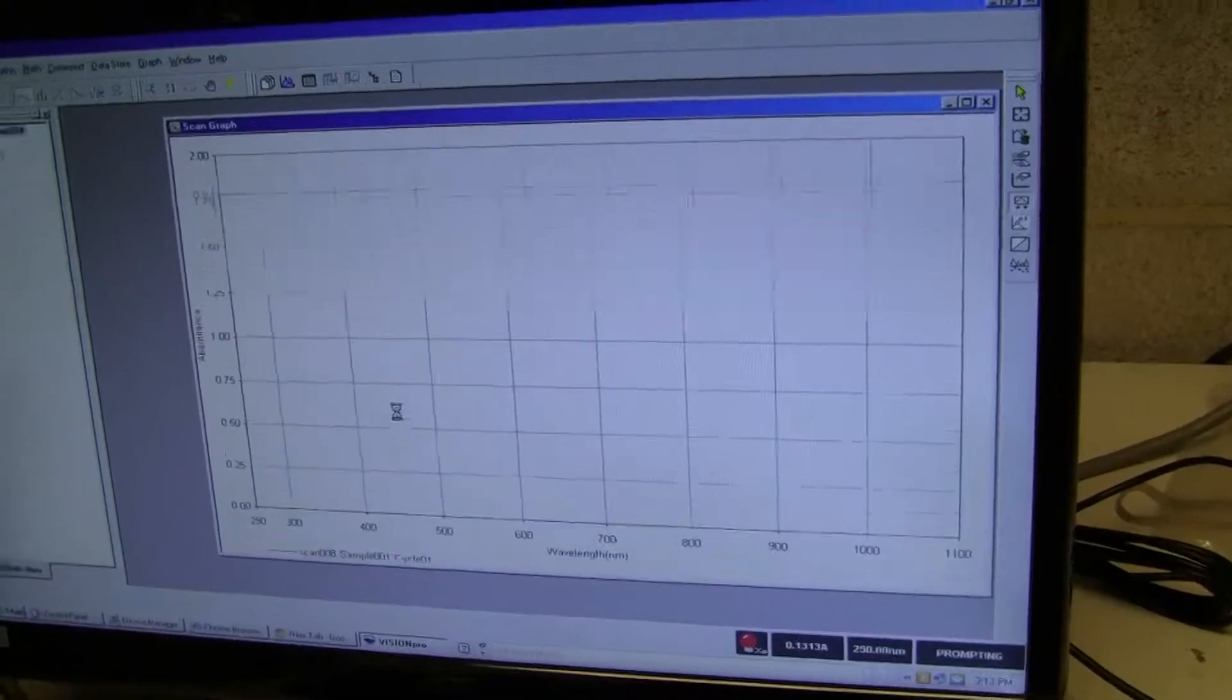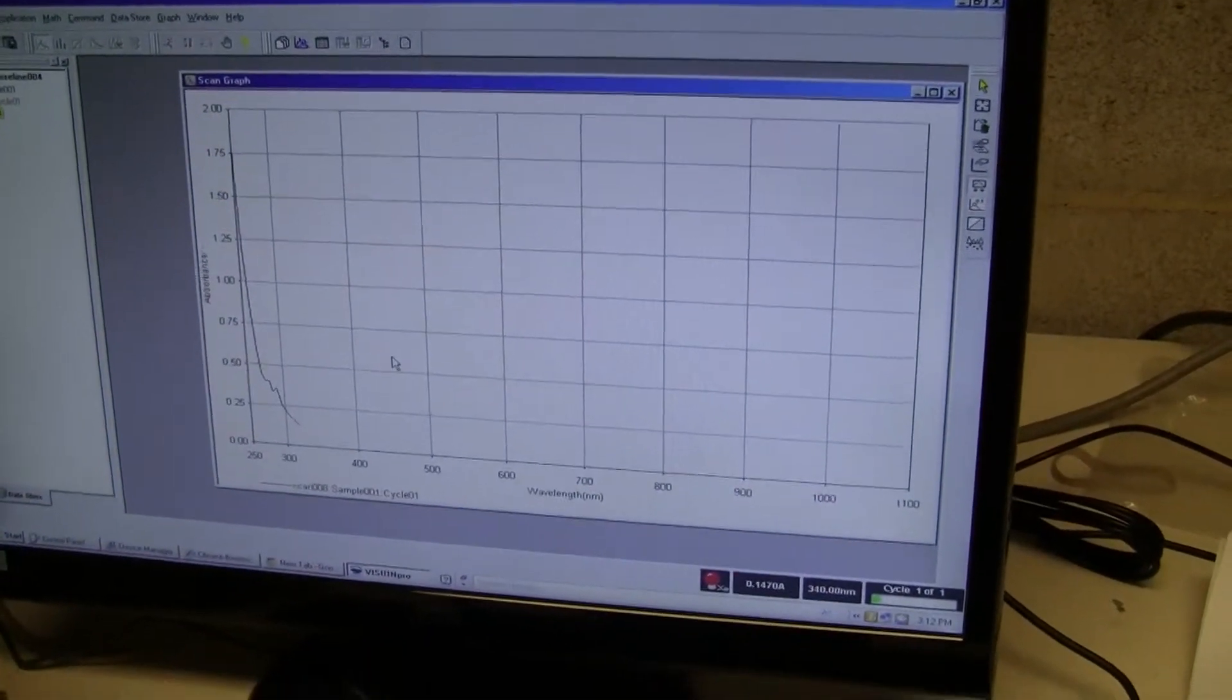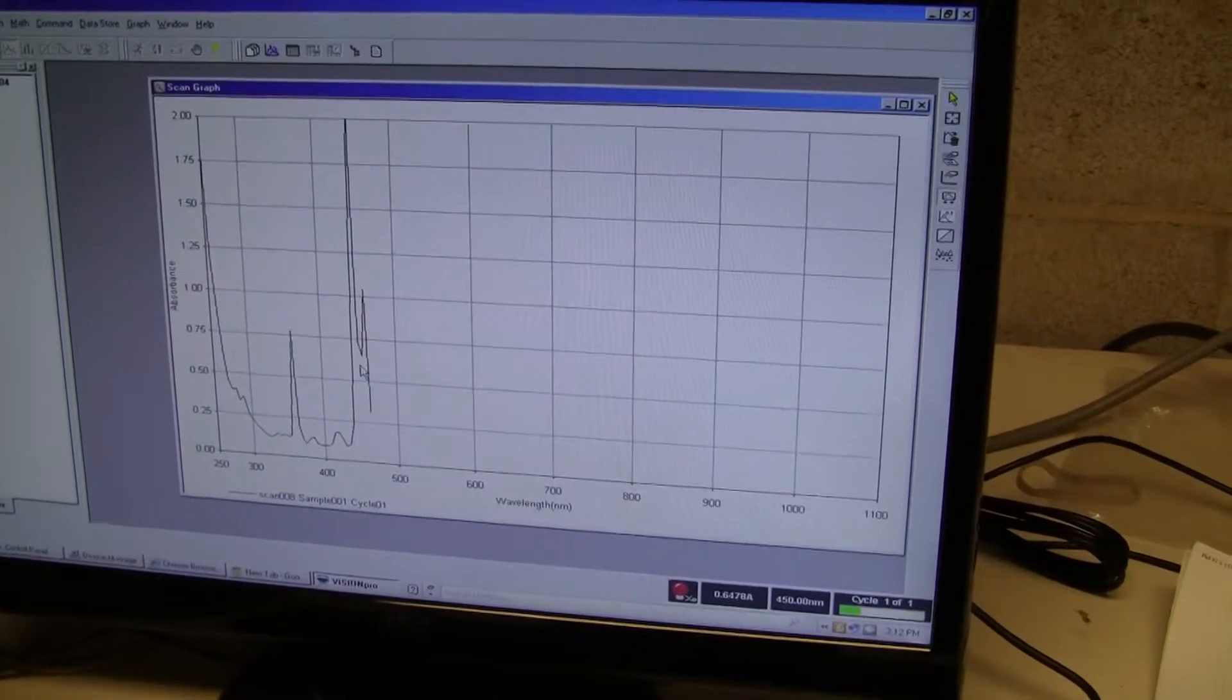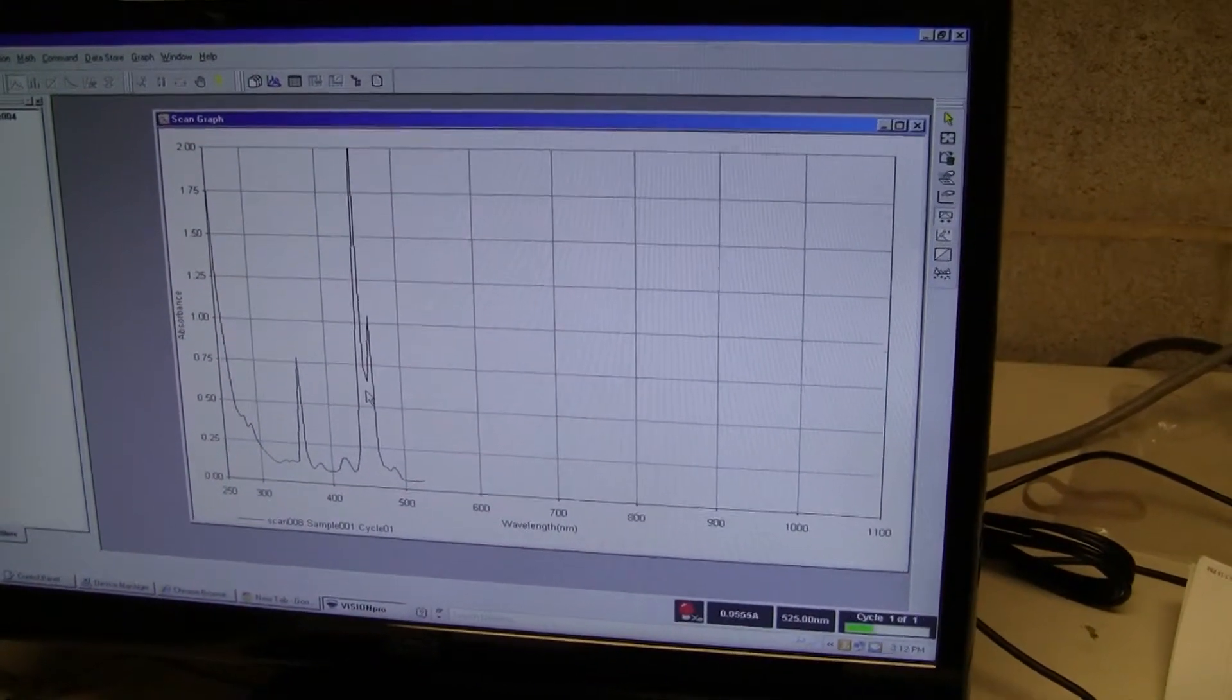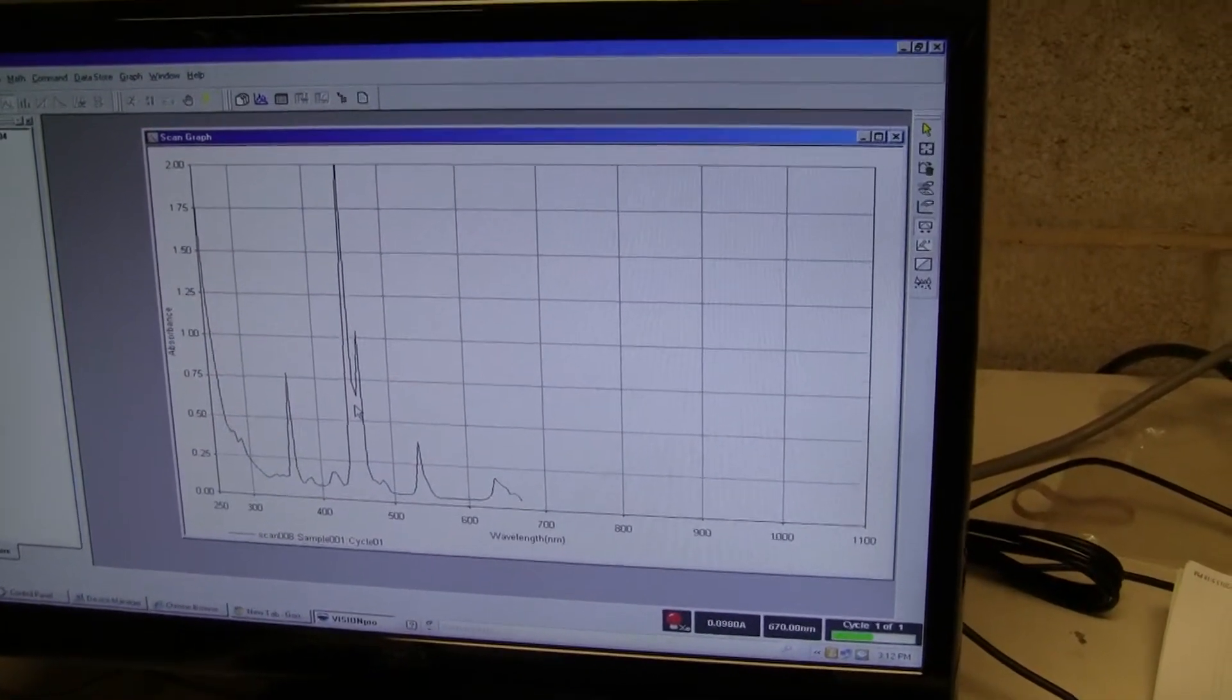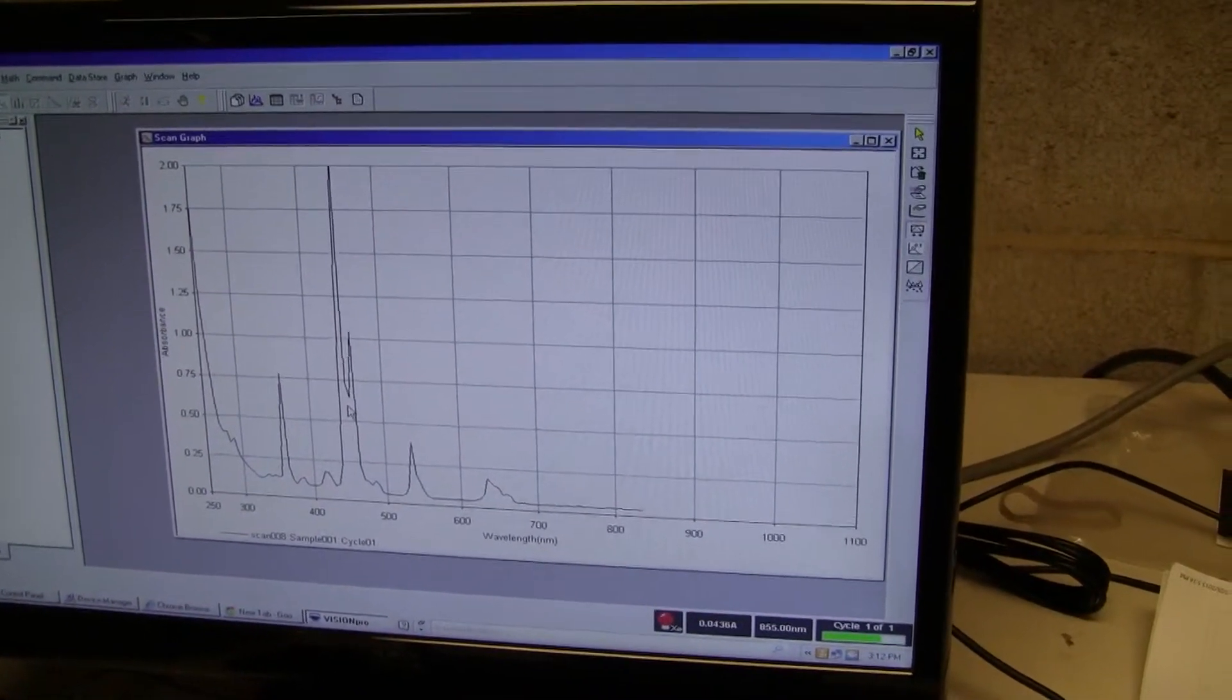Sample one, proceed. And we're getting some nice peaks.